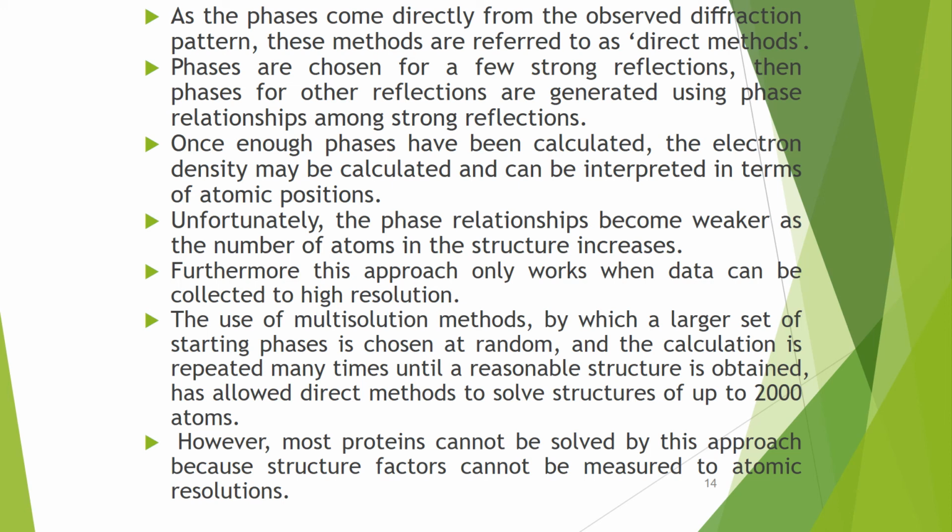However, most proteins cannot be solved by this approach because the structure factors cannot be measured to atomic resolution.